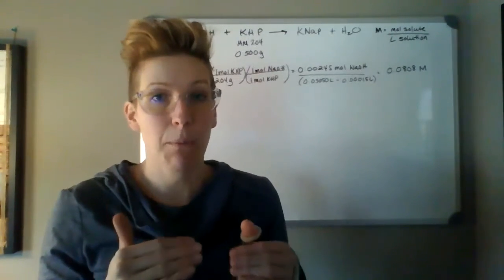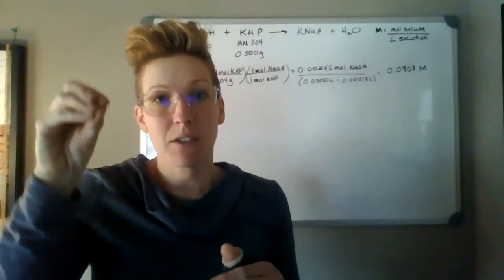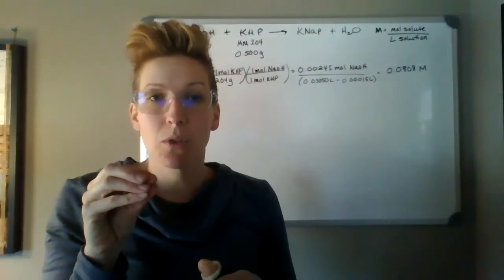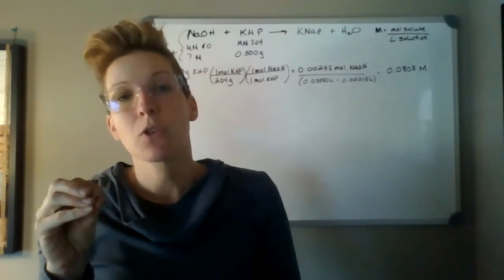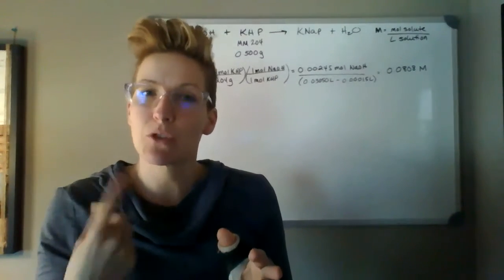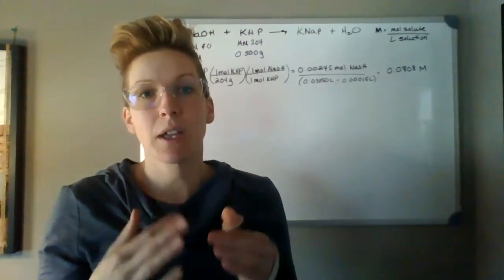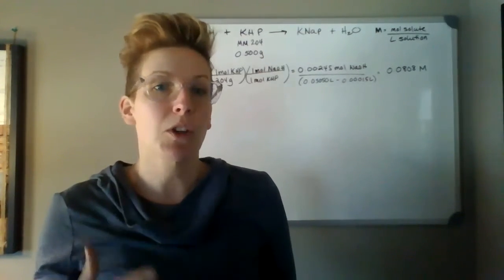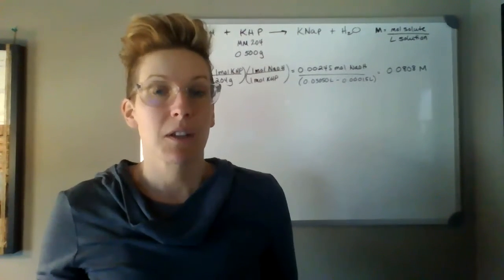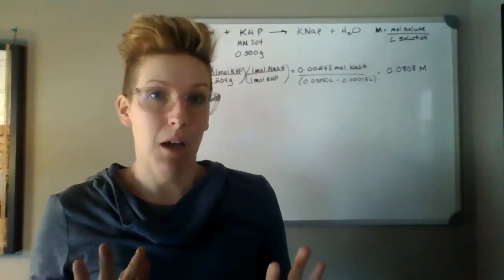Then after some time, when we're almost at that point of equivalence, so when our acid equals our base, that pink is going to hang around for a little bit longer, because think about it. As that base goes in and turns pink, and there's only a few acid molecules left, it's going to take time for those few acid molecules to find that base to react. The whole time you're stirring it, by the way, with a magnetic stir bar, so it just persists for a little bit longer. And that's how you know you're getting close to your endpoint. So that's when you really want to slow down and go drop by drop, letting each drop react and making sure that it disappears. And then there's going to be that final drop where the solution stays pink.